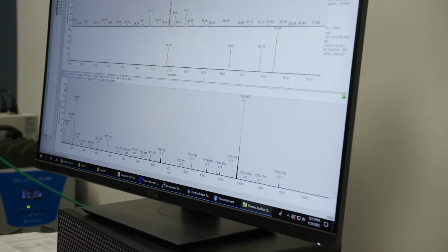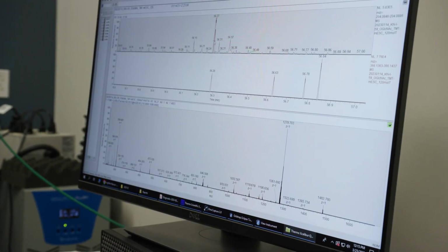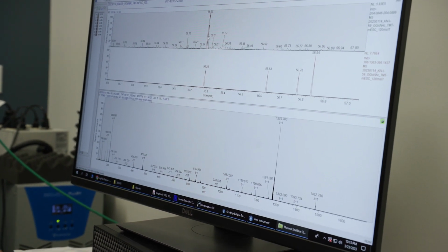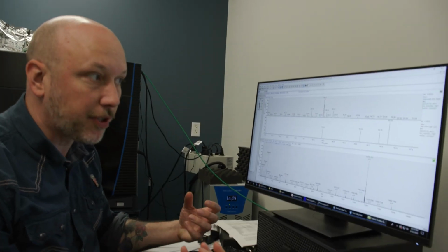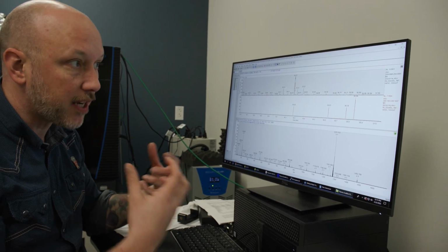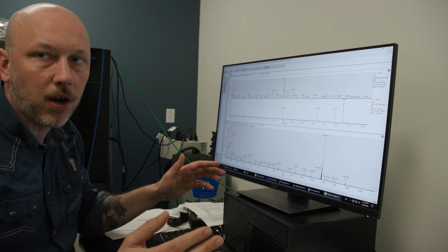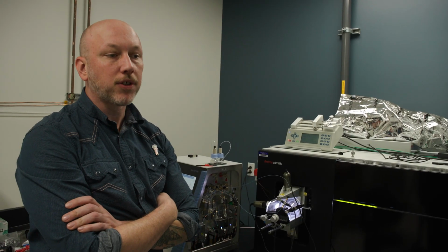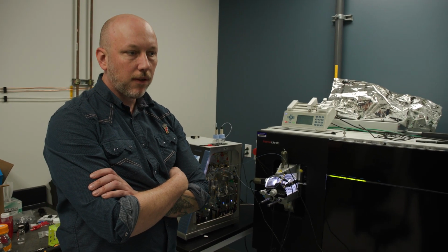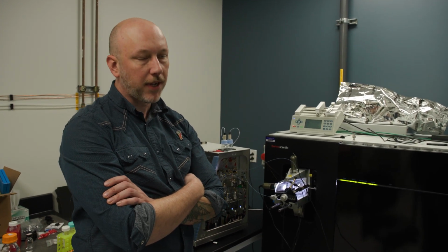But that was in the days when we were identifying 100 of these. Now we're identifying several thousands of these. And so we turn a lot more to automated software to help us initially find things. And then for ones that are particularly important, or ones that we think might be important for immunological function or disease states, those are the ones we'll go in and look at by hand to make sure that the software is calling them correctly. So we're asking new biological questions and we're approaching immunological challenges from a new perspective. But as far as the instrumentation goes, I'm standing on the shoulders of giants.